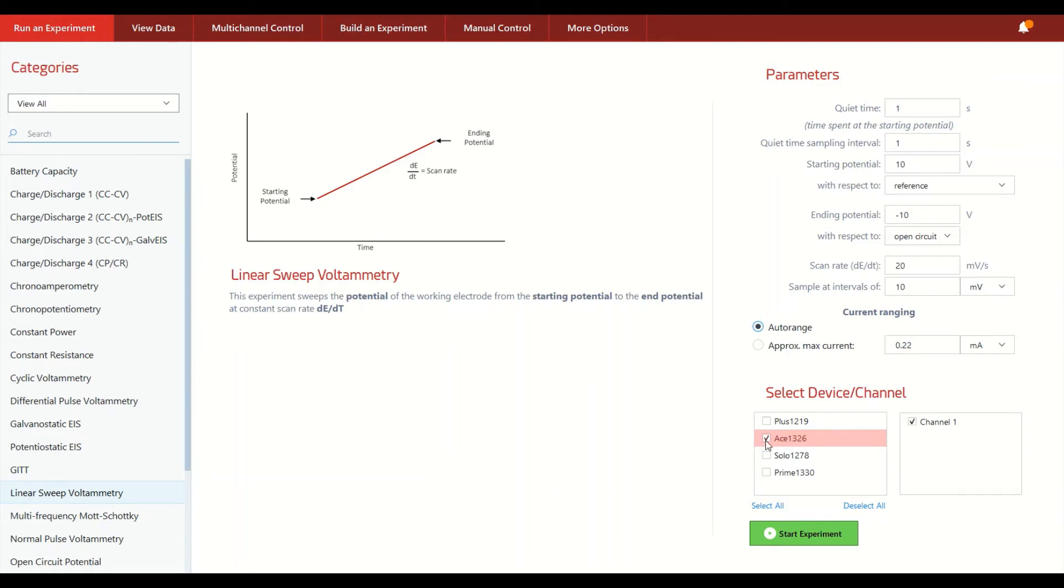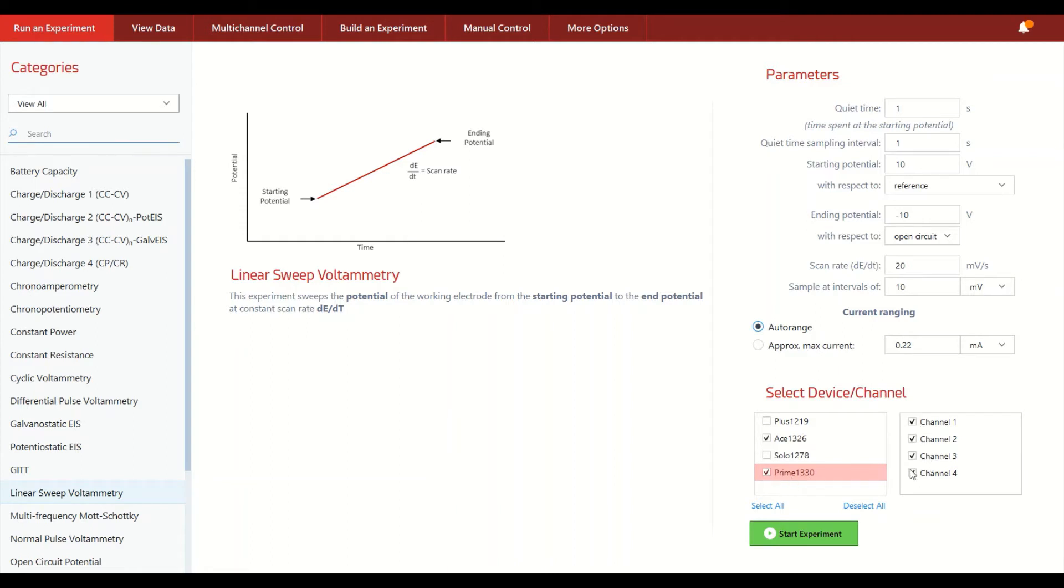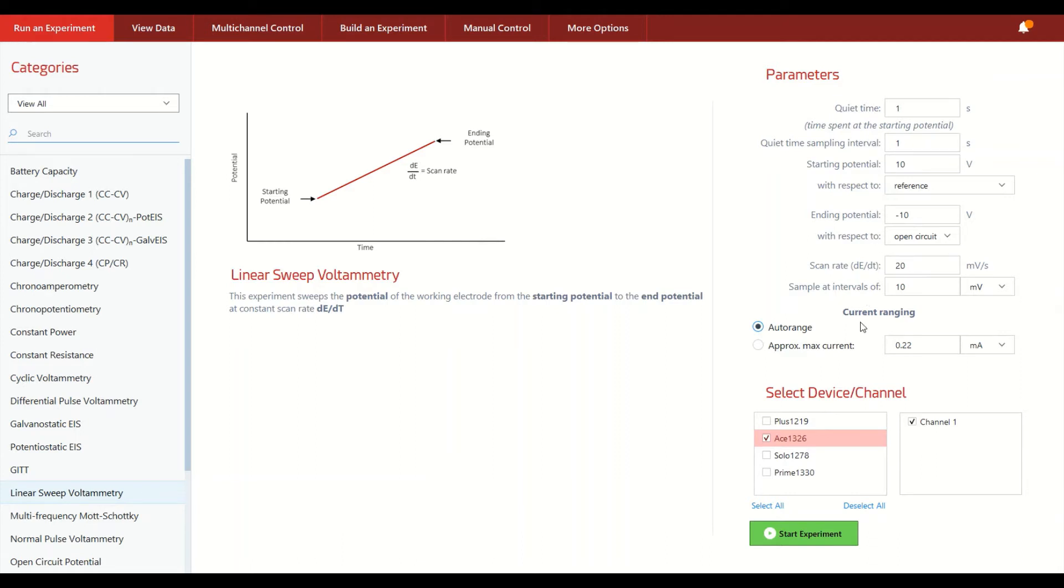So for example, we could pick one of our Squidstat ACE units to run it, or we could pick in addition to the ACE having all four channels of the Squidstat Prime run it at the same time, or maybe you want fewer channels to run it. The point is it's very easy to select one or more channels to run this exact same experiment and their start times will be fully synchronized.